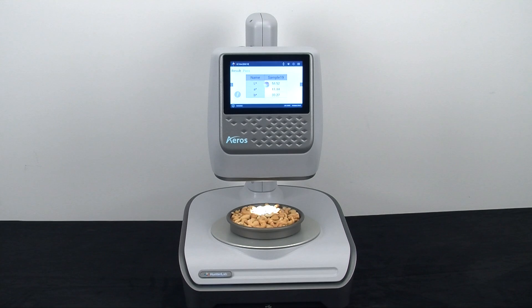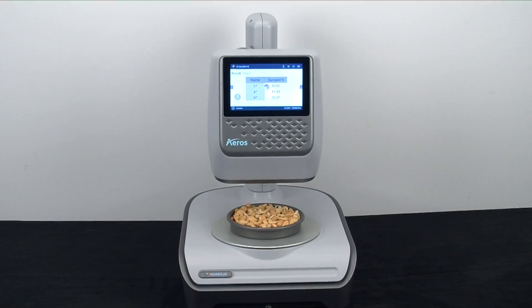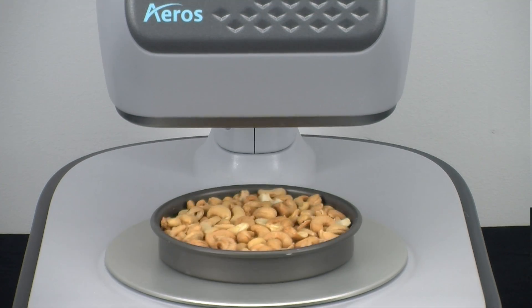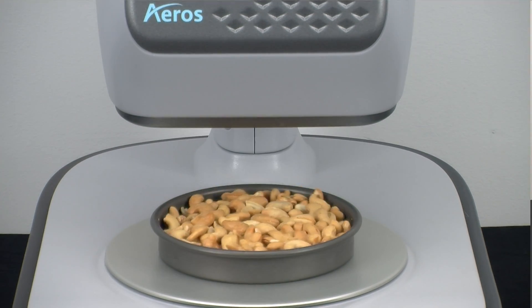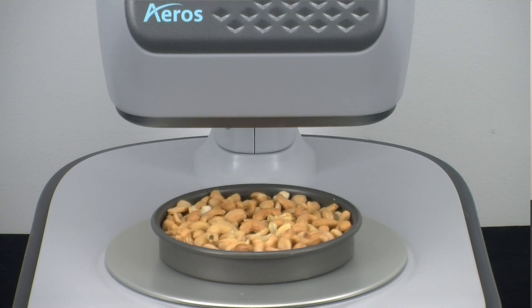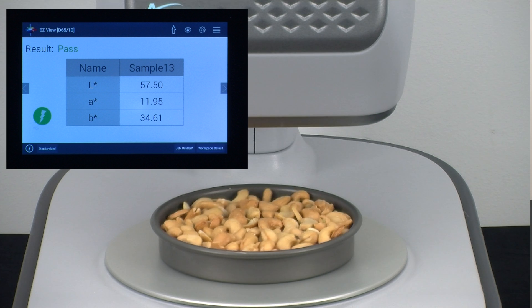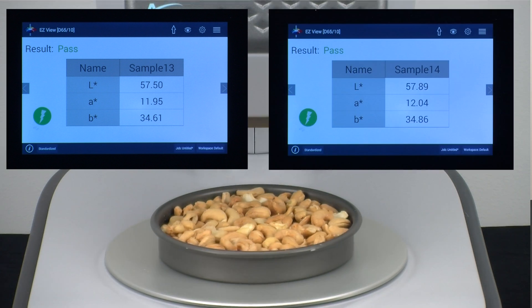Now let's measure the same sample in a standard sample tray. One important factor on how Eros meets the challenge is the sheer number of measurements it takes and calculates into one value. By virtue of its rotating sample platter and speed of measurement, which is seven per second, Eros measures the largest sample surface area of any color measurement spectrophotometer in the world and provides you with industry-best accurate and repeatable color values.